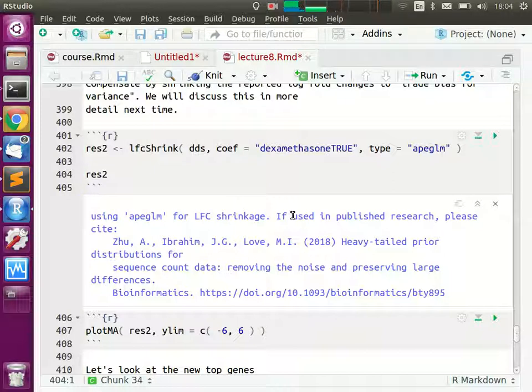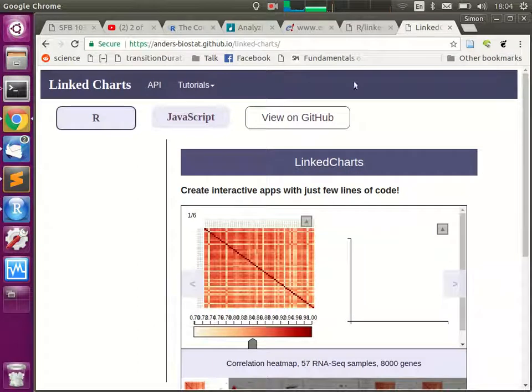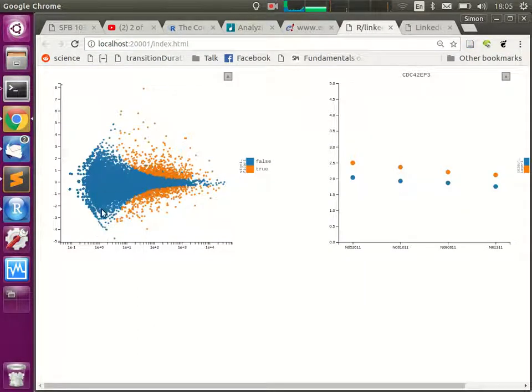There are loads of genes with 5-fold, 10-fold change, which only have 2 or 3 counts, and many of them are not even significant. That is no wonder, because if we are in the range of an average of 3 or 4 reads per gene, then having 1 read more will completely change the fold change. Having 1 read more in each of them can quite easily bring us accidentally up there. So just the fact that a single read can completely change the fold change means that these fold changes for the weakly expressed genes can be completely exaggerated.